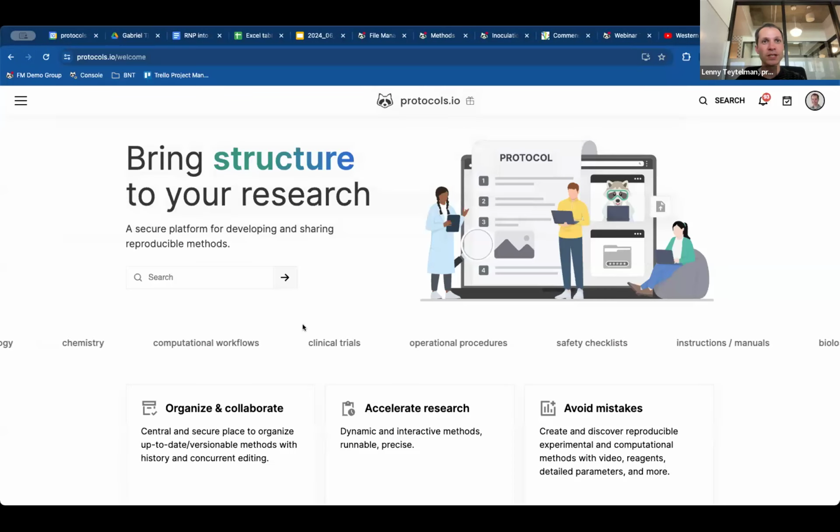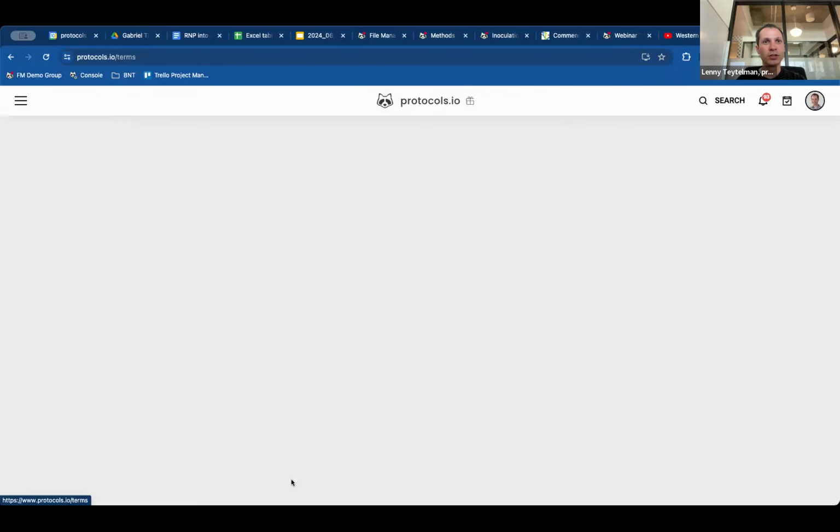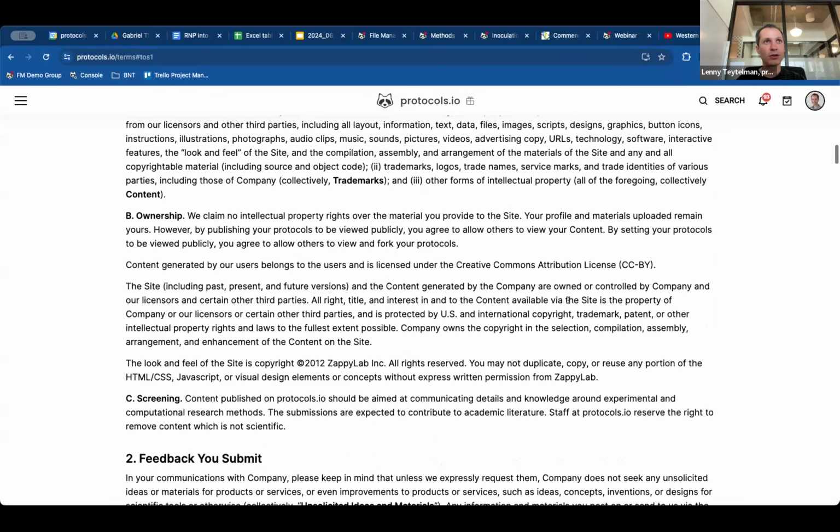The content is yours. So I think if you can see my screen, if you go to terms of use, right there is the ownership, right? And we make it very clear. We have no rights to the material you provide. It's yours. You can delete it.